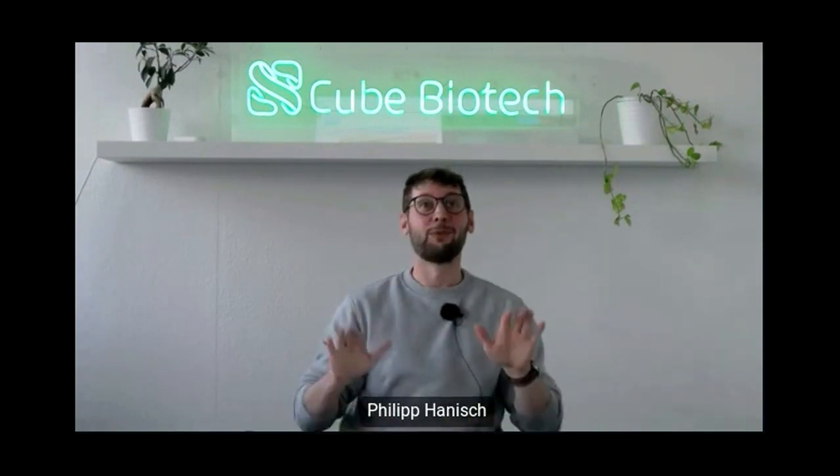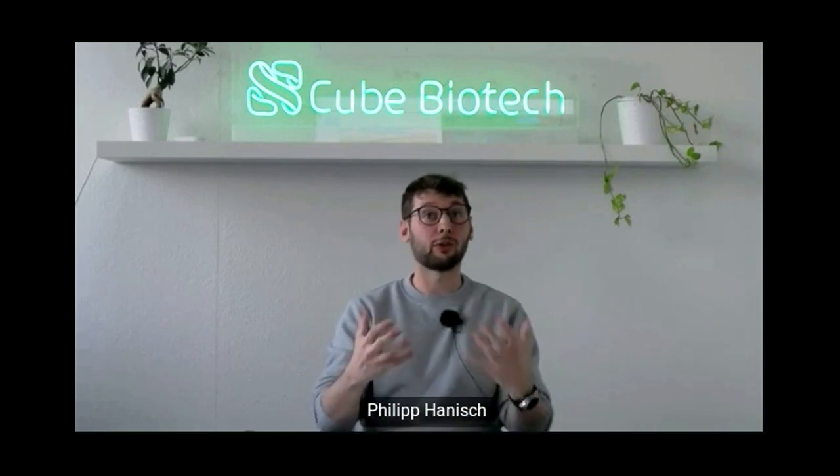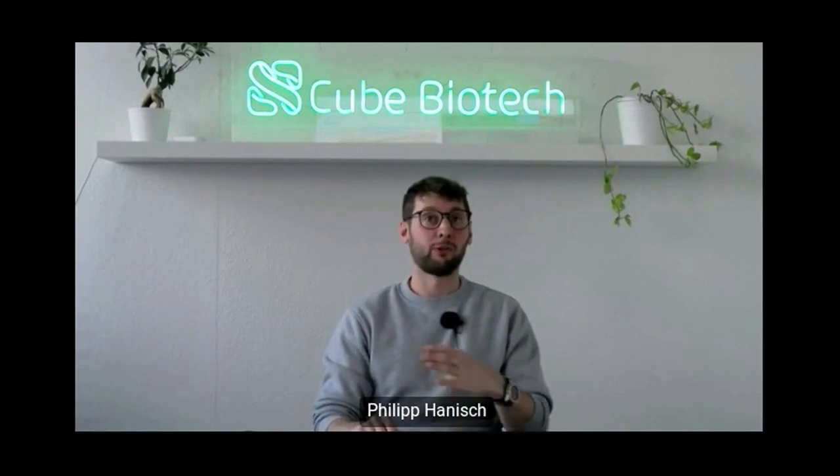That's fine. So we produce them both in full length, and we put them together, and we could also see an interaction there. So this was a great success. We can do basically whatever you want, from big to small, from small to big. All this works. So it's very nice to hear such a broad range, and that really adds to your capabilities in terms of binding assay measurements, if I understand correctly.